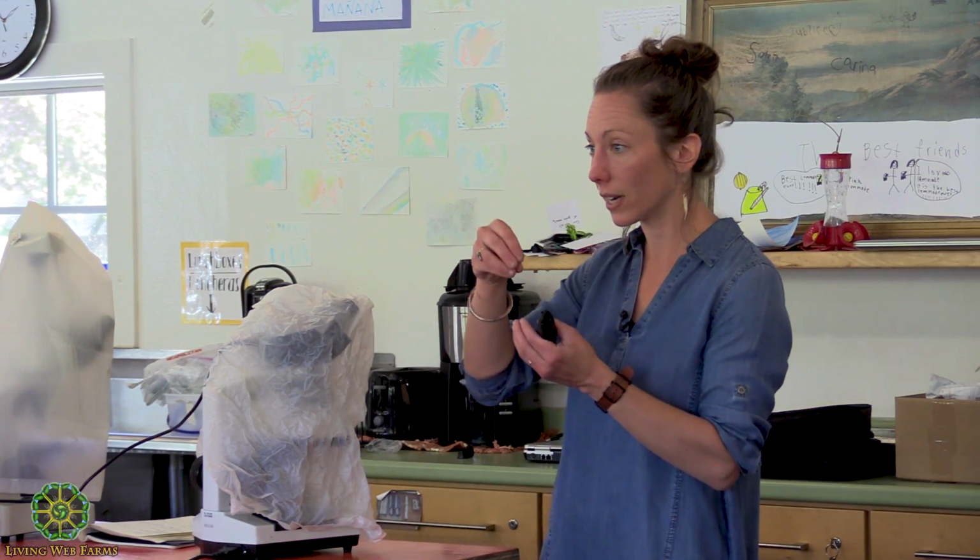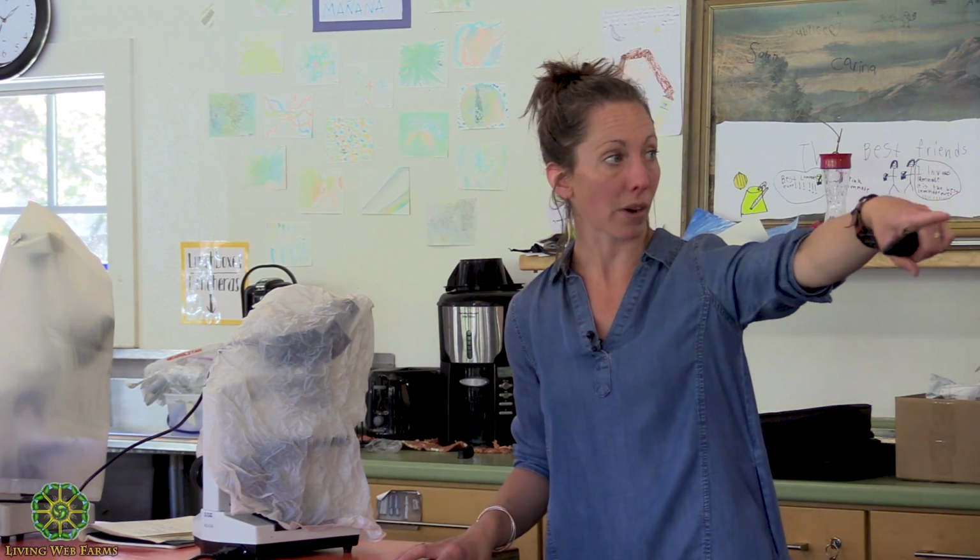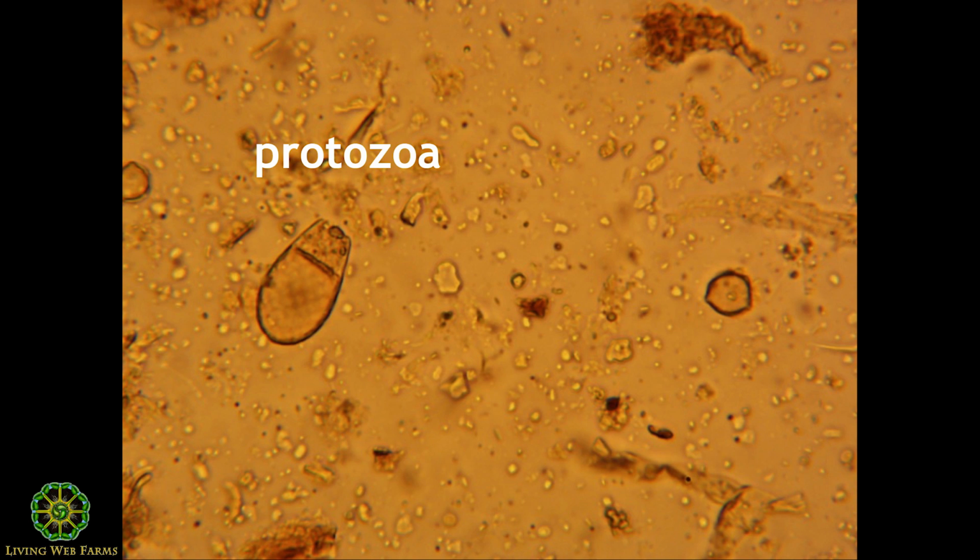But in the soil that we have scooped, chopped up, taken a clump of, put in a test tube, put some water in, and given a gentle shake, you're mostly going to be seeing, do you see these round blobs on the left there and then on the right? Those are examples of cysts.